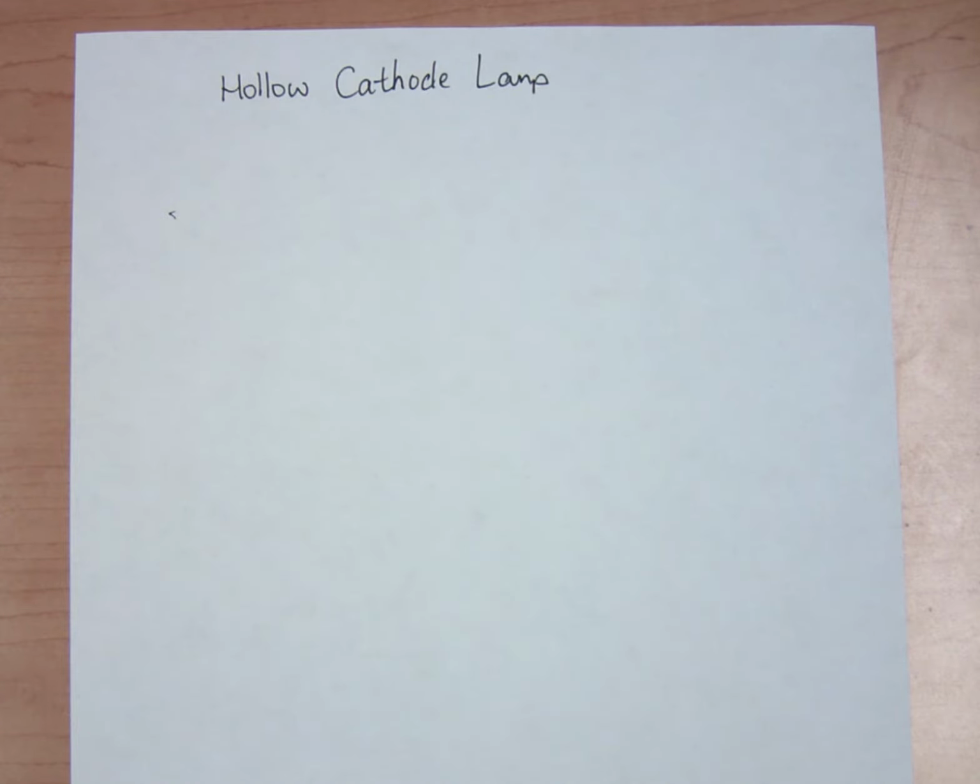So we're one or two orders of magnitude away from the precision that we need in wavelength selection in order to be considered monochromatic light for atomic absorption. So we're going to need some other kind of light source that's going to give us very monochromatic light. And the light source that we're going to talk about that fits that description is the hollow cathode lamp.